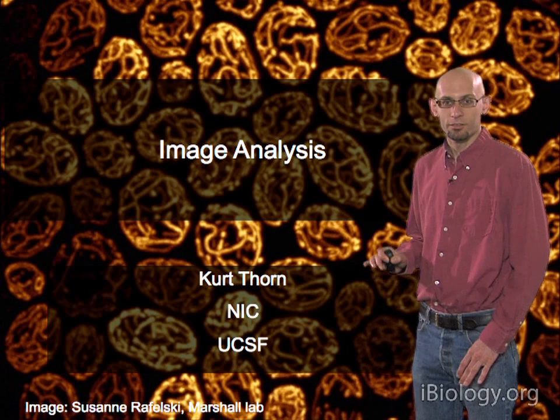The net effect of this kind of kernel is to do a smoothing or an averaging of your image. And as I said before, you can also use a Gaussian kernel, which looks like this. And so it's basically what you would expect: bright in the center and then falls off smoothly as you move out from the center. And that would do a similar kind of blurring operation, except it would be more weighted just towards the pixel in the center and its nearby pixels.